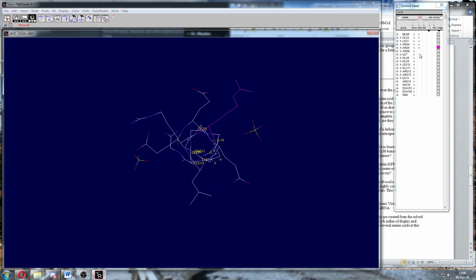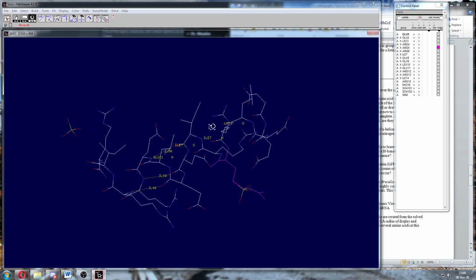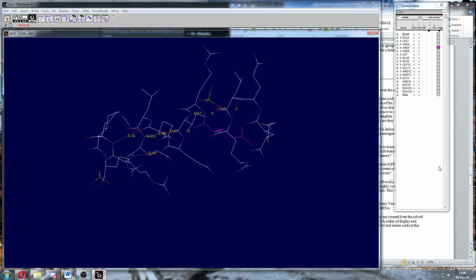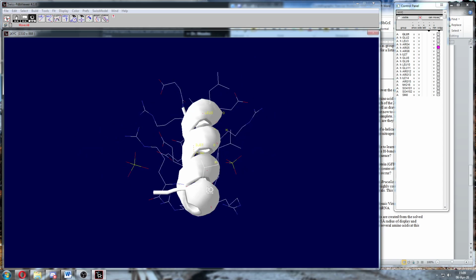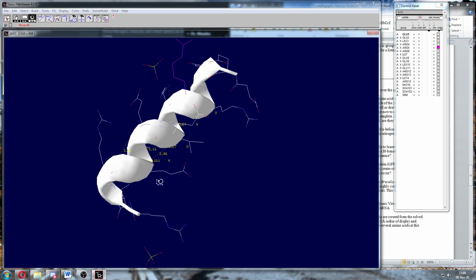And if I keep going around, putting these on, you notice they just keep rotating 100 degrees each as I go around, all the way to the end. And that's how the R groups stick out from an amino acid. We can also show that with our ribbon drawing in here. It's a very crude ribbon drawing, but you see they all stick out from the ribbon. All the R groups are pointing outward radially.